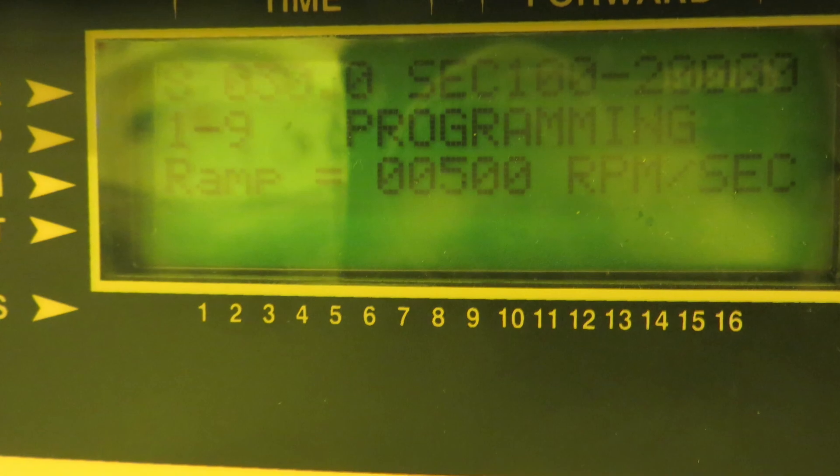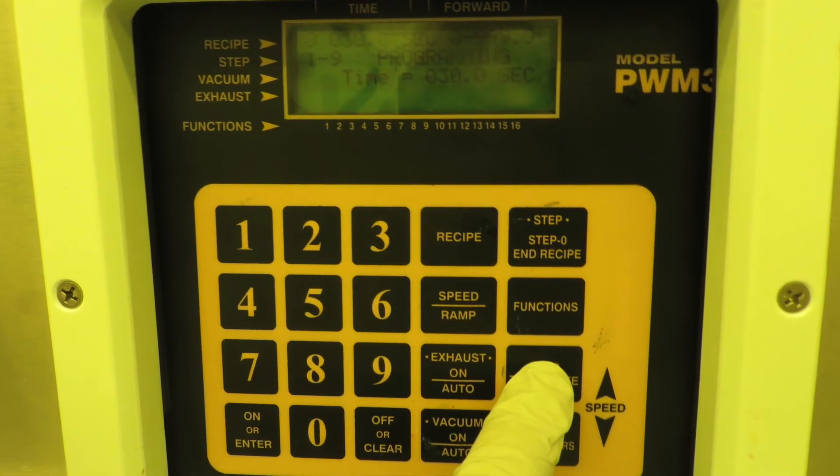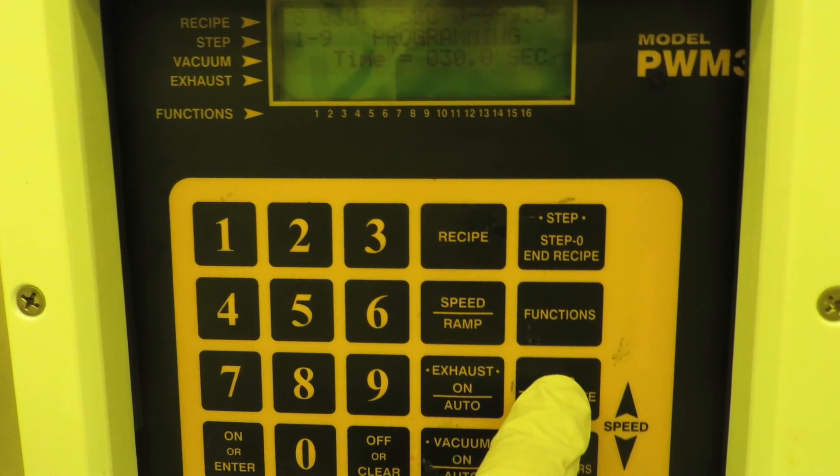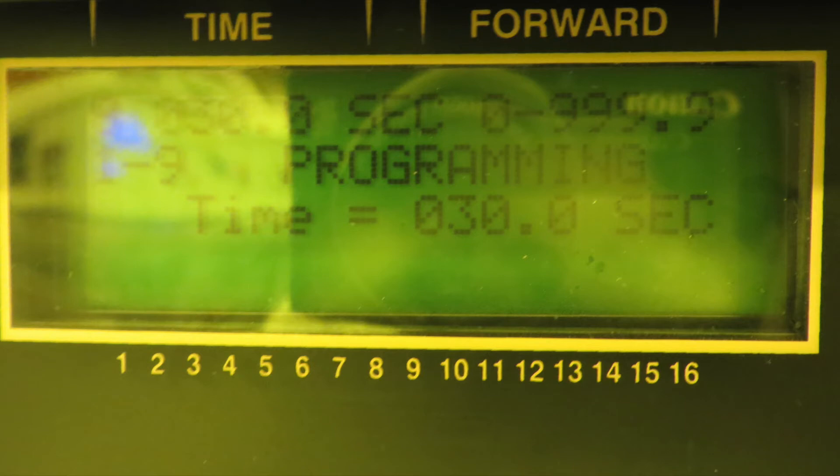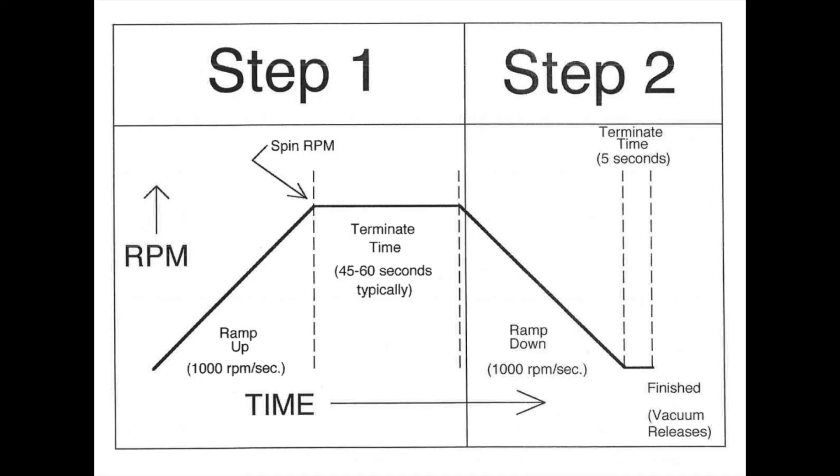So in a normal two-step process, the second step will just be getting it back down to zero. So you would enter zero as the speed for the second step, and then whatever ramp you want to come back down. And then the terminate time would be the time that's left over after it gets to zero. So if you want to keep the sample on the chuck for maybe one more second after it stops spinning, you would put maybe one second for the terminate time of the second step.